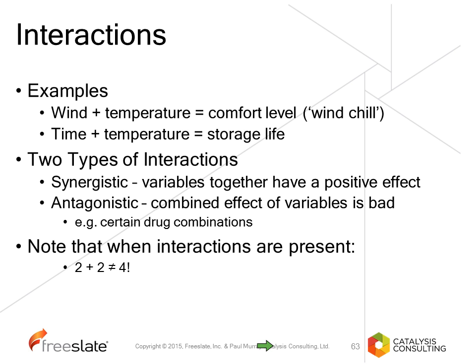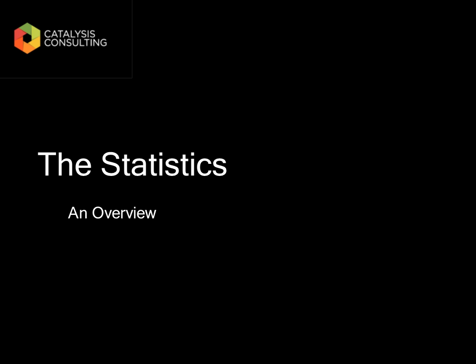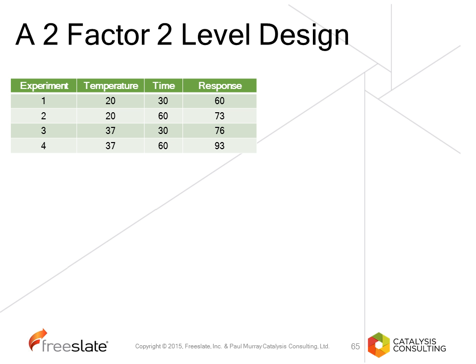Now, DOE involves the use of statistics, but please don't let this put you off. I'll just try and explain very quickly a little bit more about DOE. So we have a set of experiments. We have two factors, temperature and time, and we have a response.